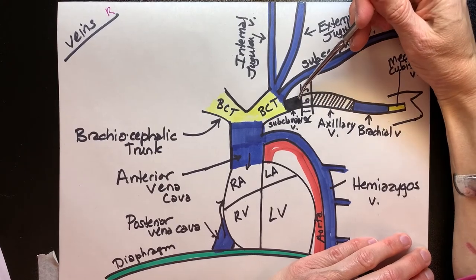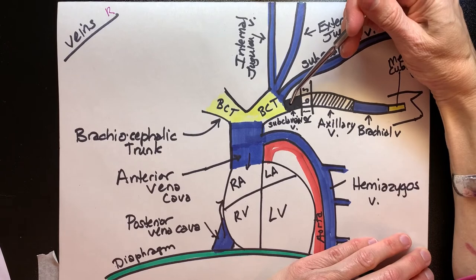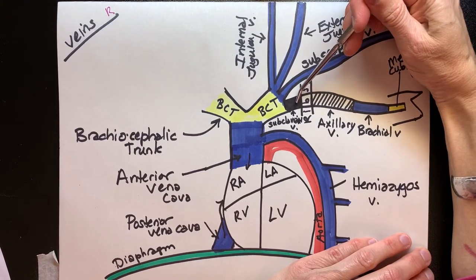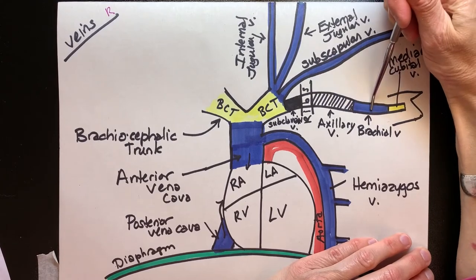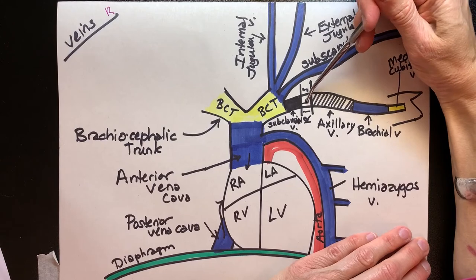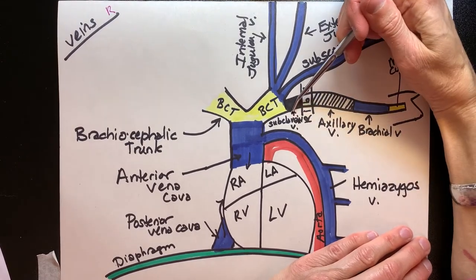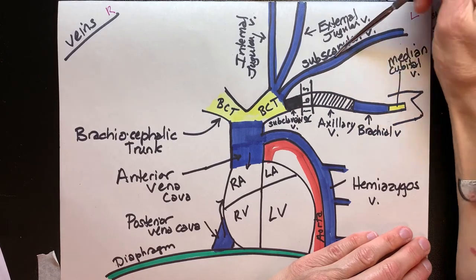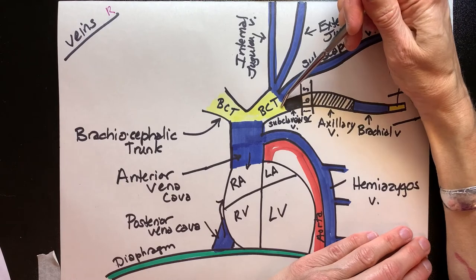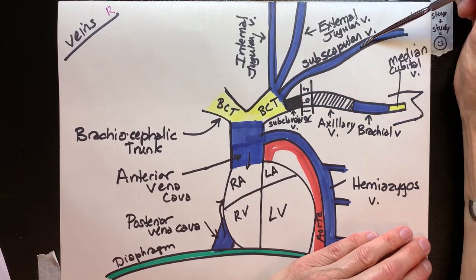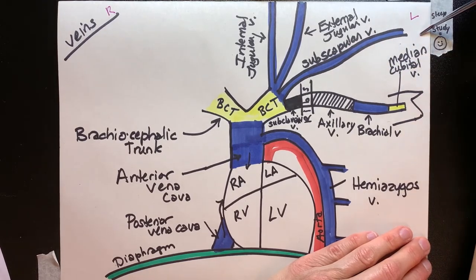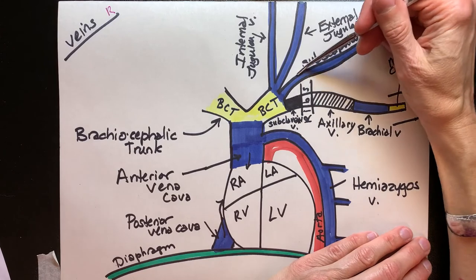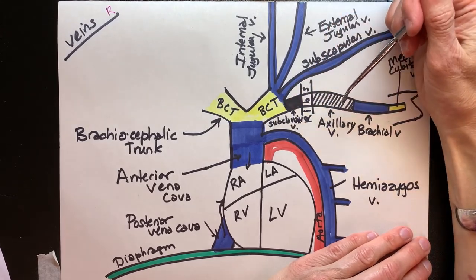As we cross through the ribs, now we're underneath the clavicle. This relatively short segment is the subclavian vein. So the progression is: elbow, brachium, axillary or armpit, through the ribs, then under the clavicle — subclavian. That runs into the brachiocephalic trunk, in this case the left brachiocephalic trunk. You can see four branches coming off it. The arm vessels make up the first branch. The second branch is the subscapular vein — you can imagine the scapula above the pig's shoulder, with the vein returning back towards the brachiocephalic trunk through the subscapular channel.